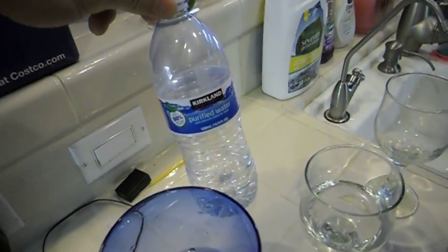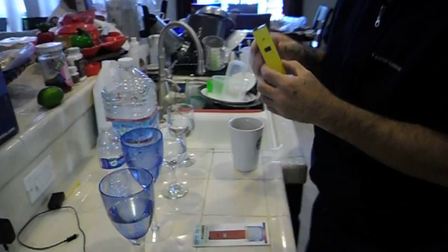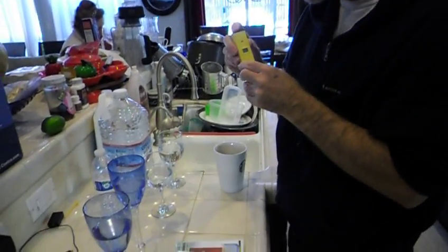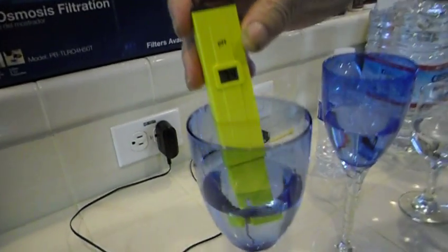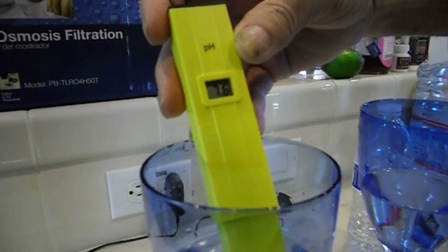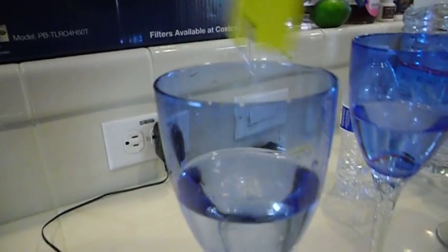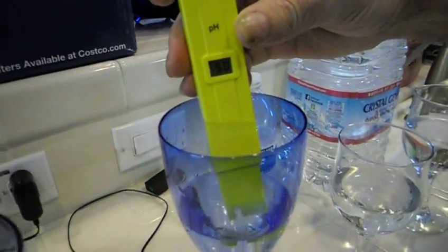Kirkland water. Now here's the Crystal Geyser water. And this is our meter. I'm going to turn it on here. This is the tap water. Look at this — we've got 7.5.